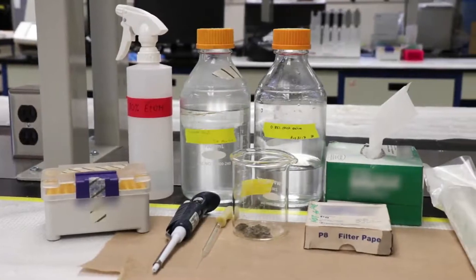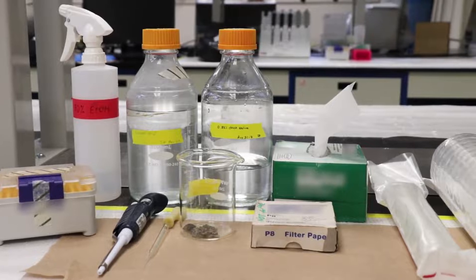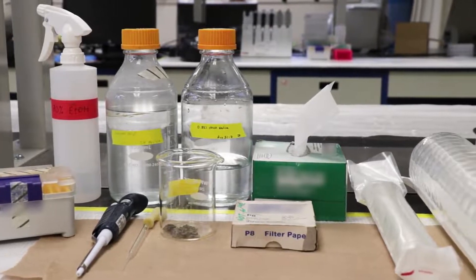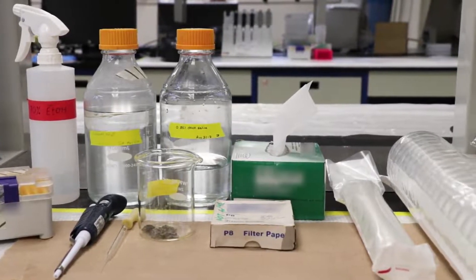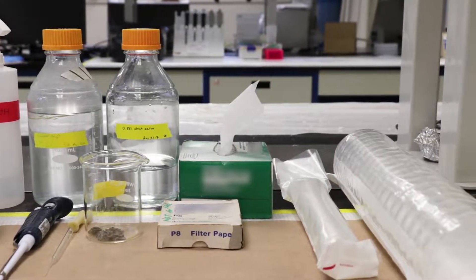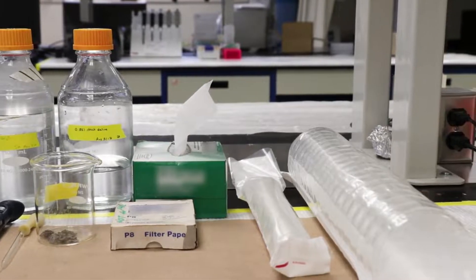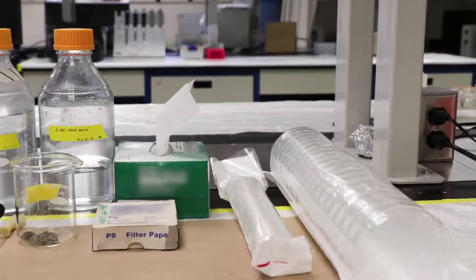Begin by autoclaving the materials to ensure that all solutions and equipment are sterile prior to the procedure. Autoclave two liters of distilled water and one liter of chick saline, along with a box of tissues, semi-porous filter paper, wire mesh, water containers, and disposable glass pipettes.